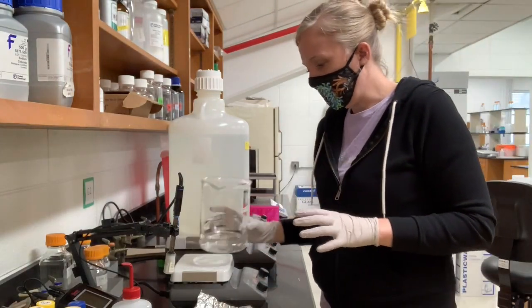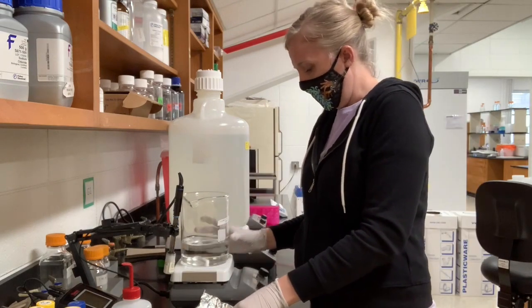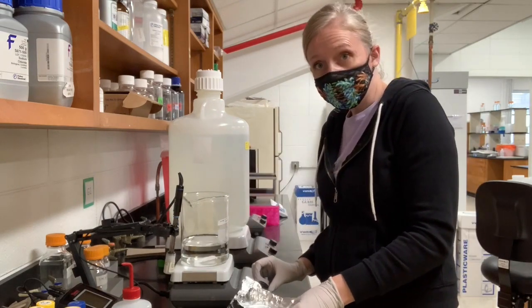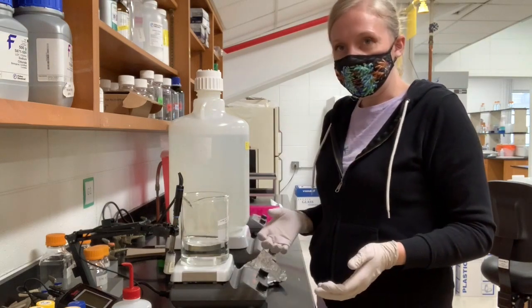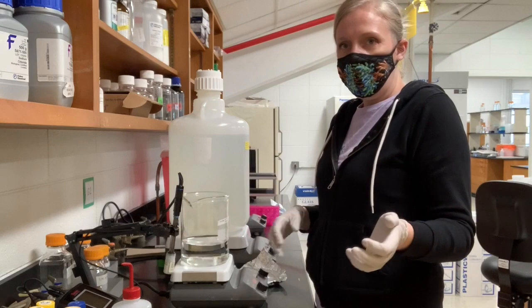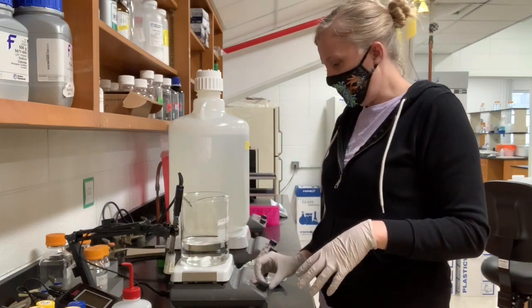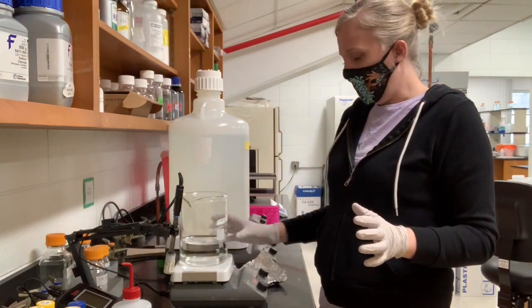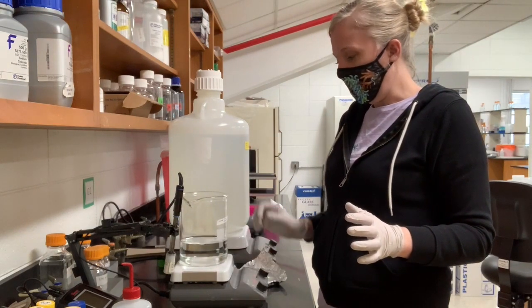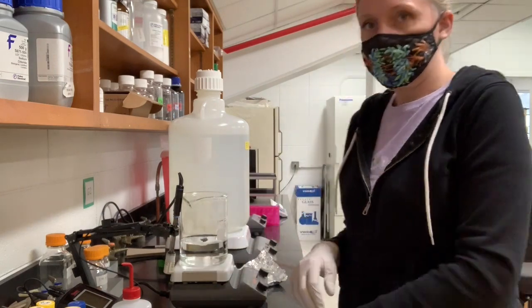I have a stir bar in my beaker, and I'm going to set it to start stirring. You want it to be stirring somewhat vigorously, but not having the stir bar knock around. You'll have to adjust the stir bar until you get a nice spin without it going too fast. I like it when it pulls a little bit of a vortex. That helps to mix things.